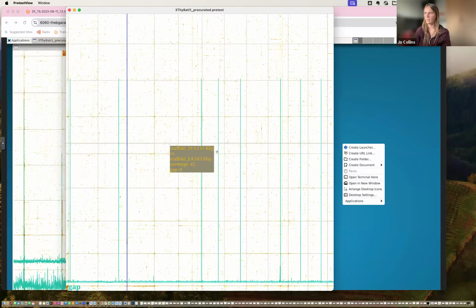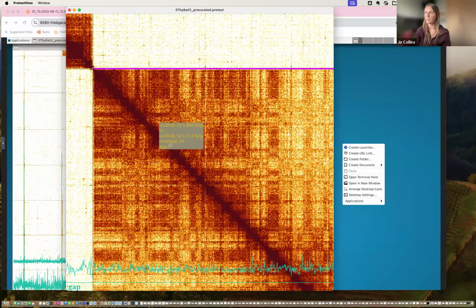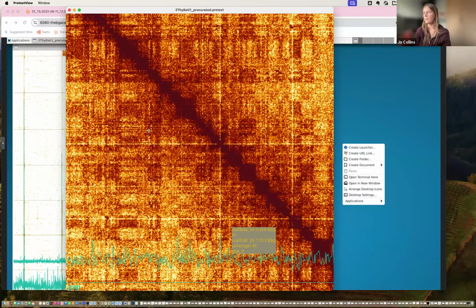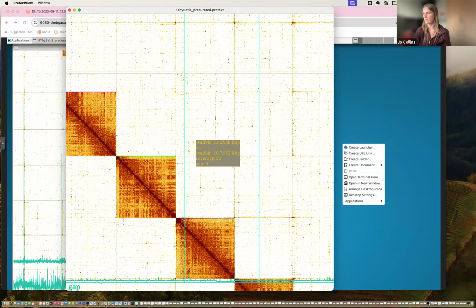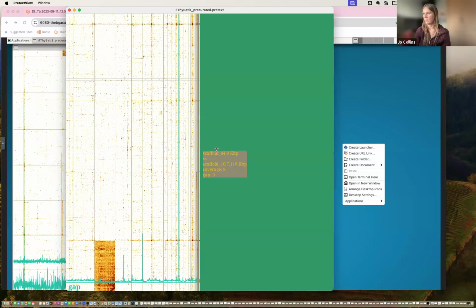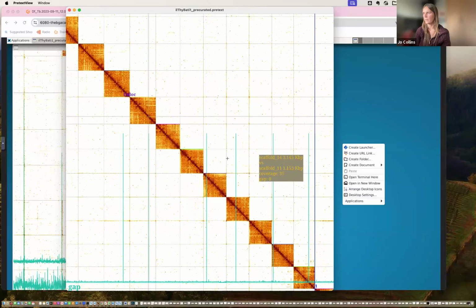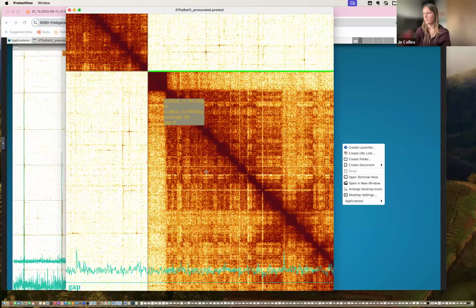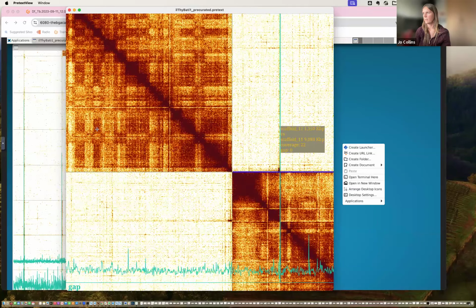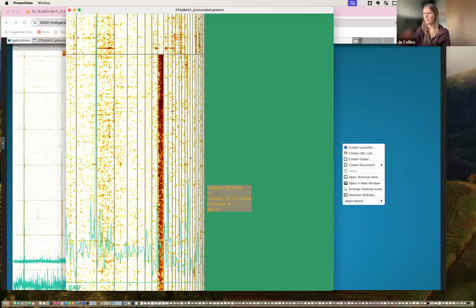That's that one. Sorry, I'm going through this quite fast so that we can get to the next phase. So again, just looking for that really strong contact. Nothing in the shrapnel. Looking for the contact. All good. We did have something here.